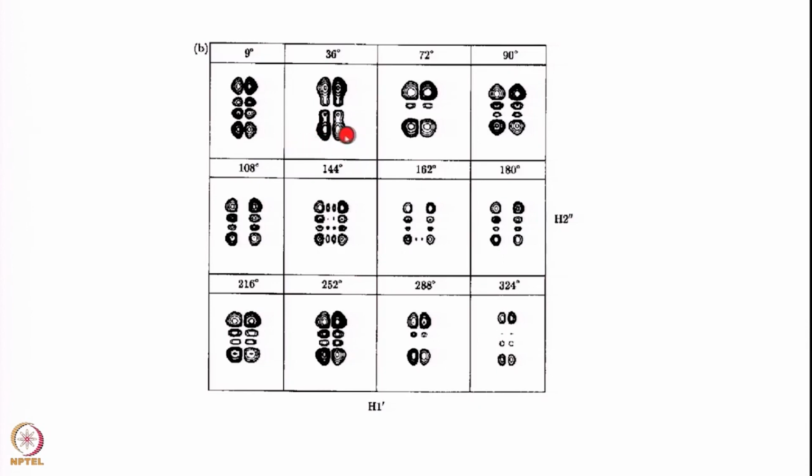You see this width becomes more, and further more, and here is the largest width, because the 1 prime 2 prime coupling is large and the 1 prime 2 double prime coupling is also available here, therefore this has the larger width along this axis. There are 4 components along this axis that you can see clearly. In fact in this one you can also see all the 16 components, so to say, right. Centrally there are some cancellations at this point.